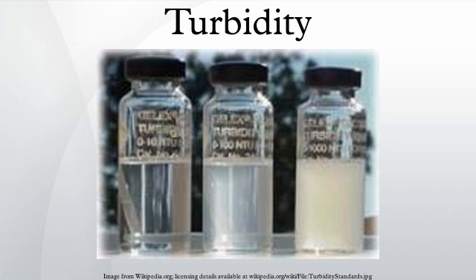Measurement. The most widely used measurement unit for turbidity is the FTU. ISO refers to its units as FNU. There are several practical ways of checking water quality, the most direct being some measure of attenuation of light as it passes through a sample column of water.